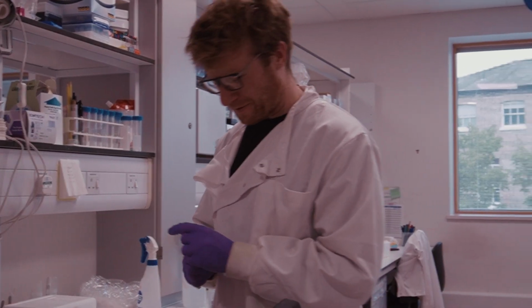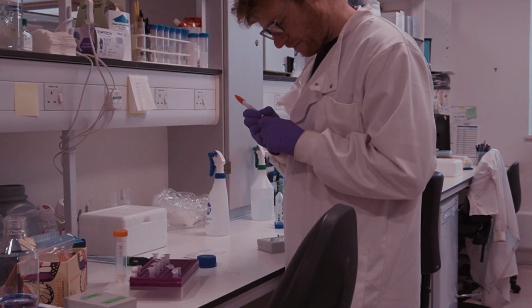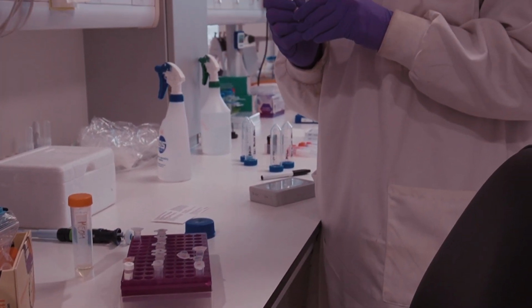John Russell is doing some cloning, which is assembling bits of DNA in bacteria, and the aim of the experiment is actually to use them for labelling cells in the developing lung so we can watch where they go live. So the idea is to turn the cells green, like green fluorescent protein, and then we have to follow them over time. But first he has to assemble a lot of bits of DNA together and put it into what we call a viral vector that allows him to infect the cells.